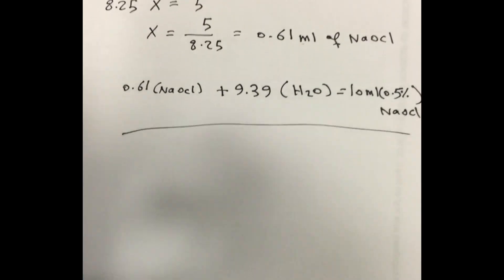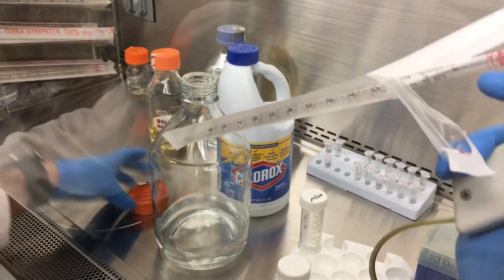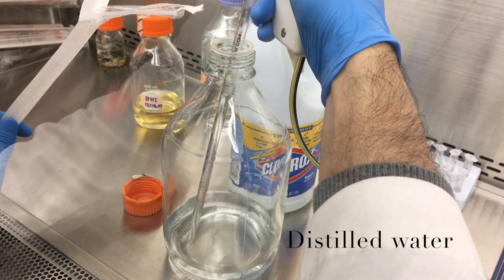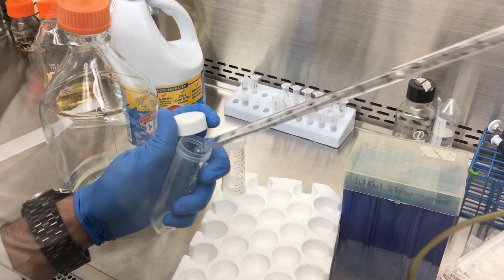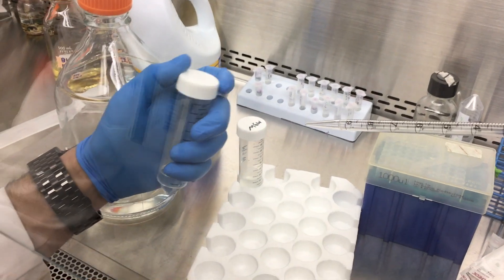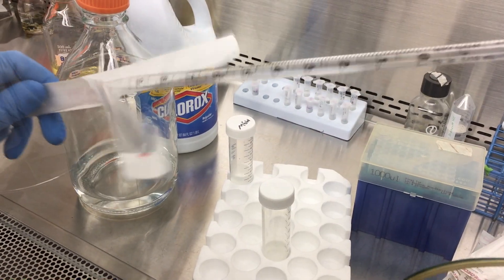We add 9.39 ml of sterile water under the hood to the test tube. It is preferred to use a 50 ml test tube in order for the pH meter probe to fit properly, since its diameter is wider than the 15 ml test tube.